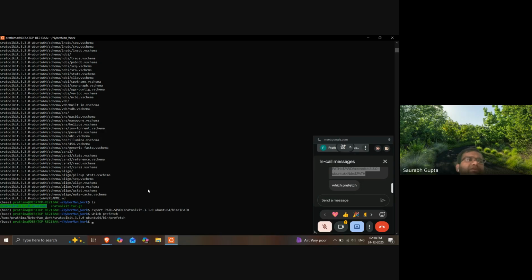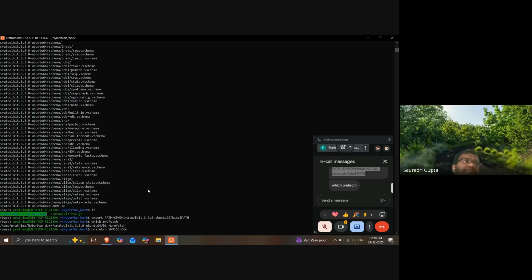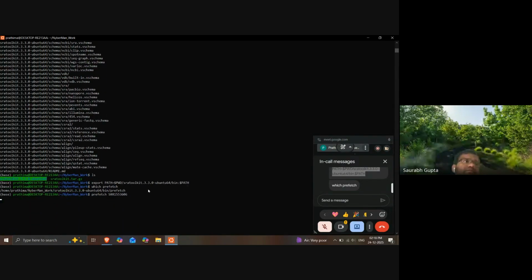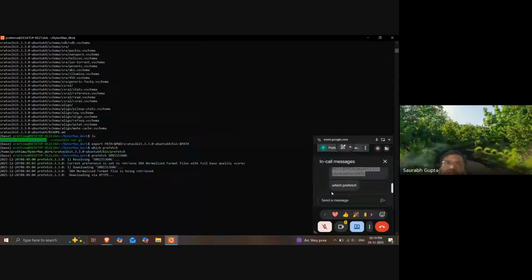Okay, and now run the prefetch command. Just go up, up, up. No, I mean the one with the ID. Yeah. Give it a second. Great. Okay. Anybody else still having any issues?